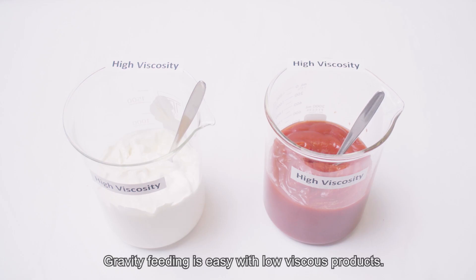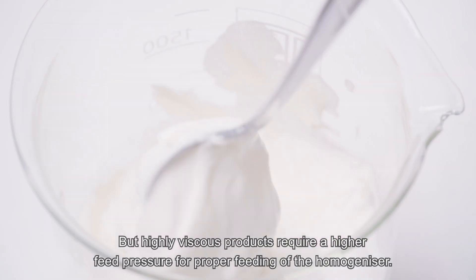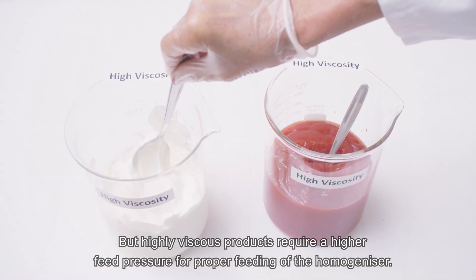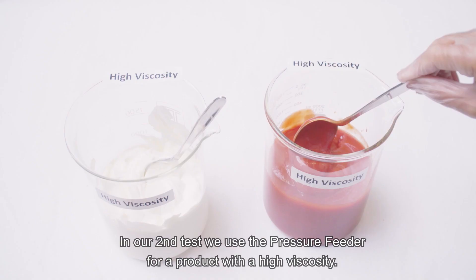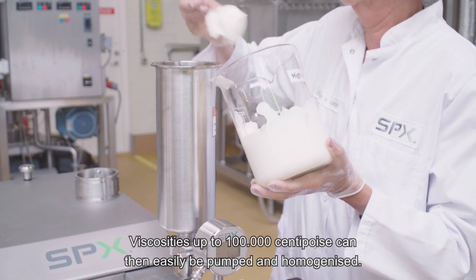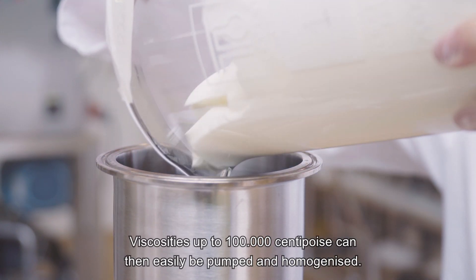Gravity feeding is easy with low viscous products, but highly viscous products require a higher feed pressure for proper feeding of the homogenizer. Examples are Greek yogurt and tomato ketchup. In our second test, we use the pressure feeder for a product with a high viscosity. Viscosities up to 100,000 centipoise can then easily be pumped and homogenized.